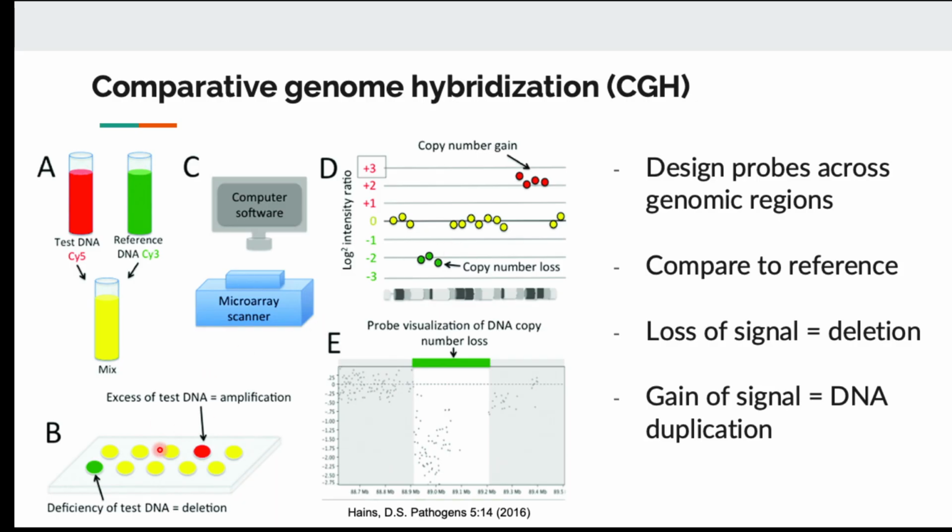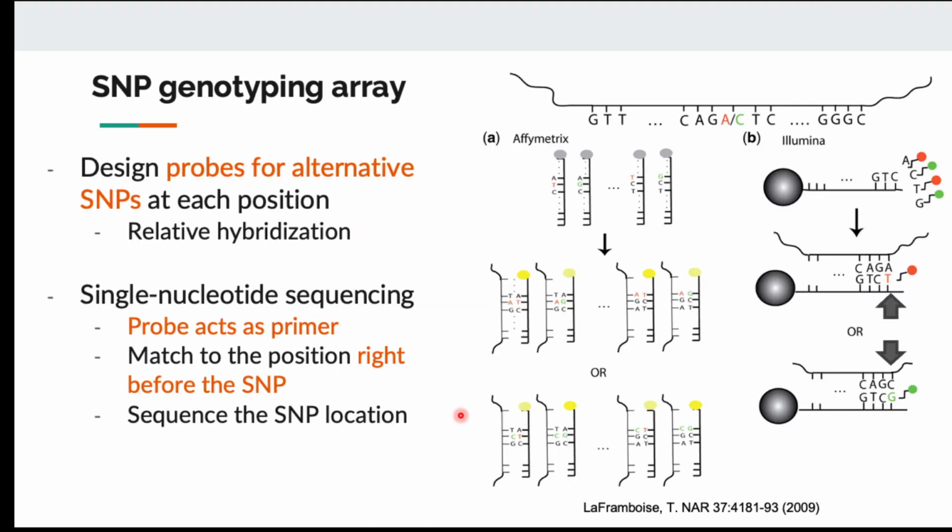But with microarray, one good thing is, let's say you pick human and you design the oligonucleotides that target the entire human genome, you create this array. Everyone in the world can use it. You don't have to run the sequencing again. You just produce this chip, this microarray, and then everyone can run their sample to get it. Okay. So that's one idea, to make microarray technology, which is cheaper than sequencing, for tasks other than transcriptomics. People also try to use microarray for SNP genotyping, so like exome sequencing, for example.